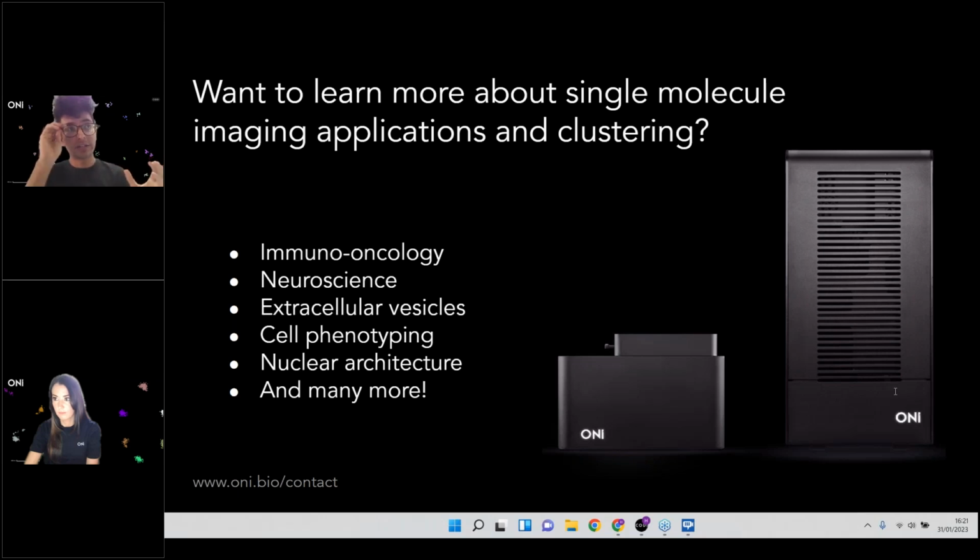Now, when you apply these constraints, you should start with the one which you picked out, and then you might find, like we did today, that when you change the skew, you end up with clusters of a different area, and then you may need to apply other constraints in order to bring us back down to the level we're expecting. But that's quite a natural process, and if you're worried about over-defining the clusters that you're looking at, repetition is your friend across different cells, across different fields of view, across different samples, and you'll quickly find that any overtuned parameters will break down in the general case. So you'll be able to find a natural set, hopefully, that you can apply more broadly.